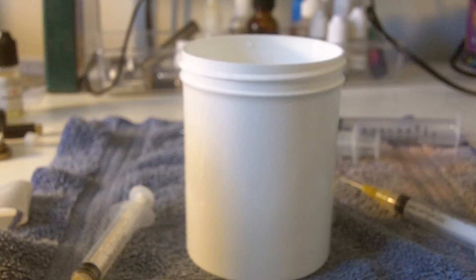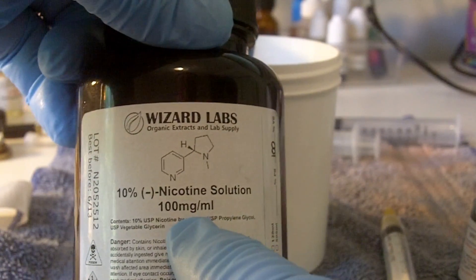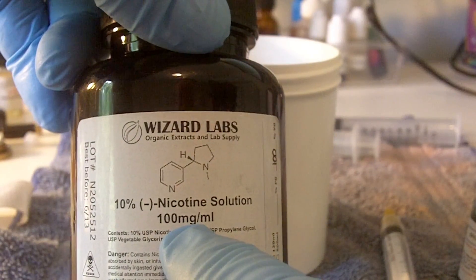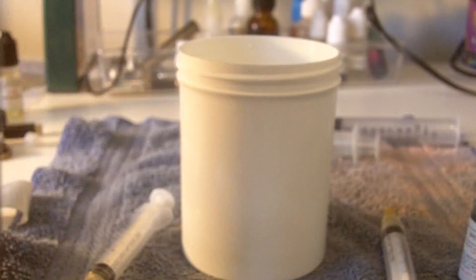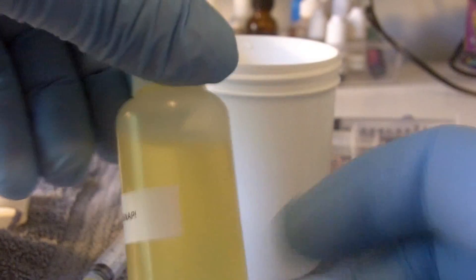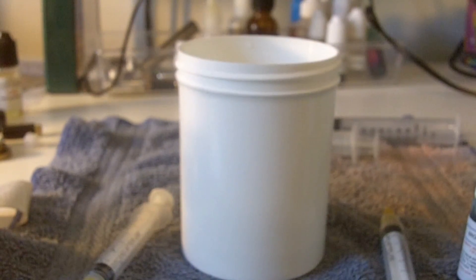Feel free to drop me a comment if you disagree. You can head out to eliquidtest.com or cherryvapes.com, who also resells these kits. With the kit you get the syringes, the cup, the bromothymol blue, and the sulfuric acid. Or if you want some nicotine like what we tested here, you can head on over to wizardlabs.us — packaged very well, double sealed and triple wrapped, and very good prices on nicotine. This seems to be pretty clean stuff. Here's a bottle of some cinnamon ginger snap I mixed up — looks nice and clear, a little yellowish from the cinnamon oil — and I've been enjoying this nicotine. I think it's of pretty good quality.